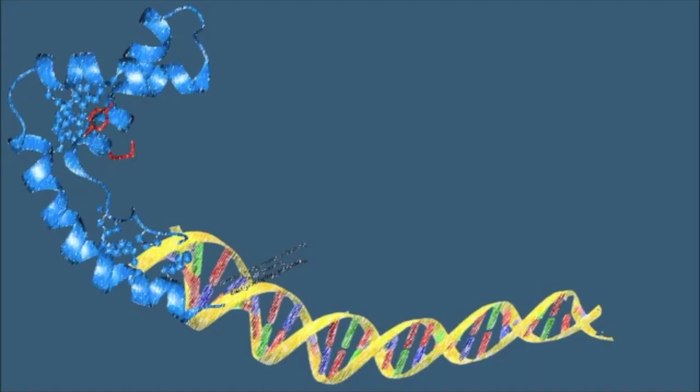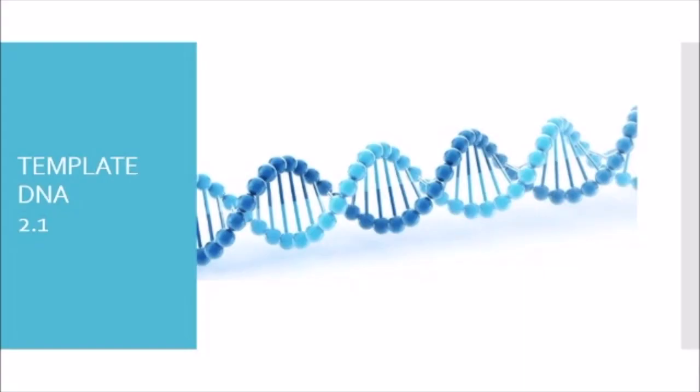To perform PCR amplification, you need to combine all the components required for DNA replication. These are as follows. DNA template. The template carries the DNA segment or target you wish to amplify.